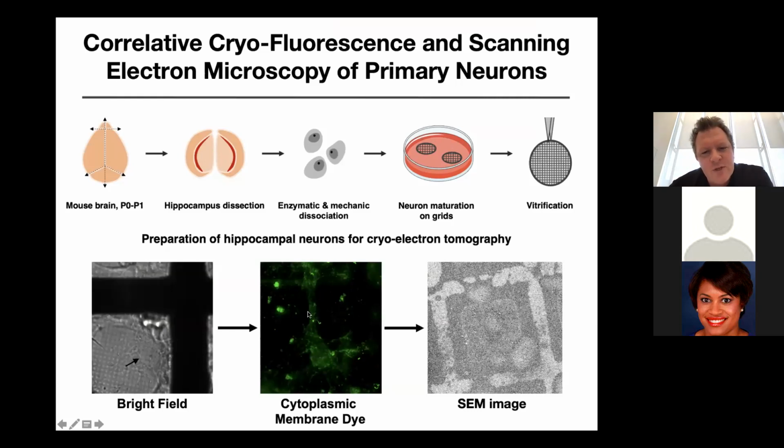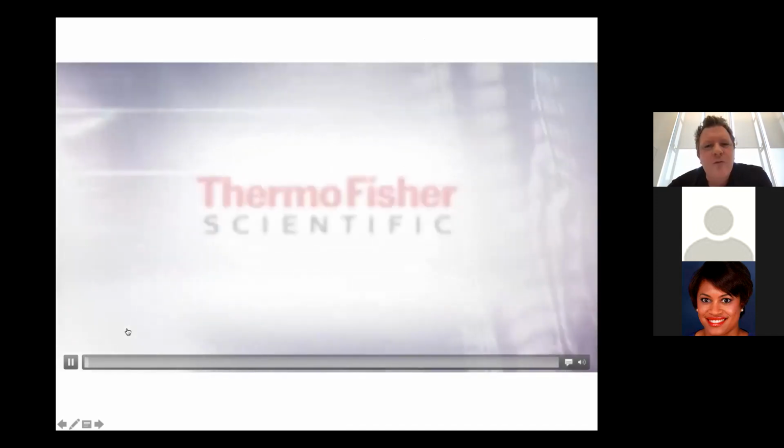So what we have to do is we have to use some kind of fluorescent staining to actually identify where the cell is. And then finally, when we take it through to the focused ion beam scanning electron microscope for shaving it down, we have to match the coordinates, because as you can see, it's very obvious that this is a neuron in this image, not so obvious now in grayscale. And so once we go into here, we have to match coordinates and then shave down the neurons so that we can actually know that we're sort of paring down in the right location.